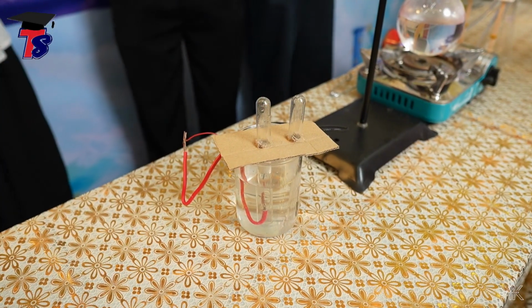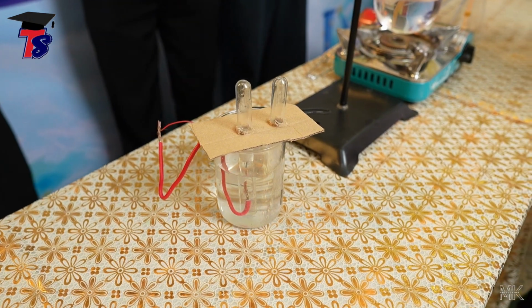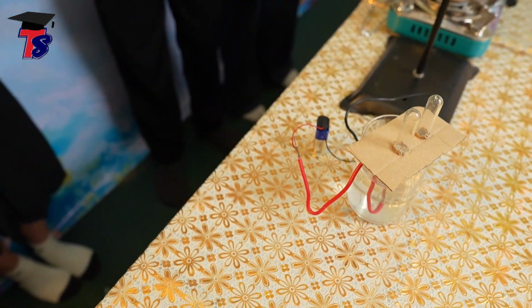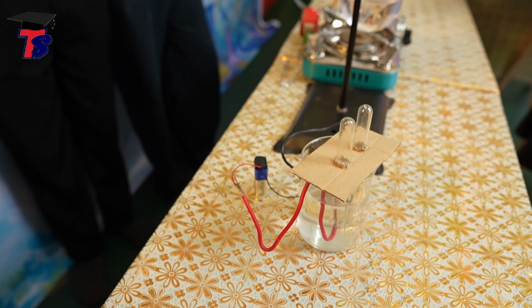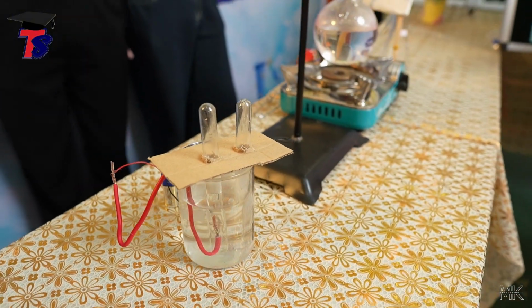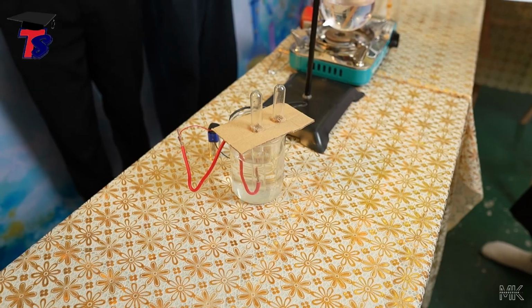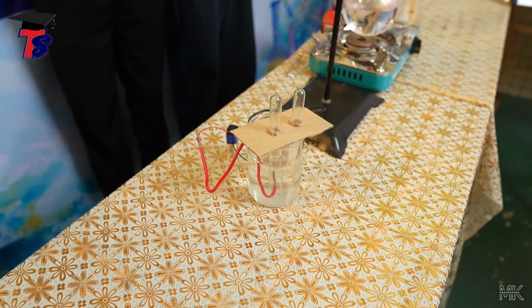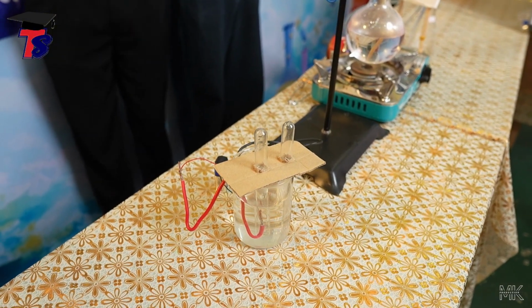As you can see here, this is electrolysis. The wires are connected to a 9-volt battery, and the solution in the beaker is sodium chloride. At the black wire, the cathode, hydrogen gas is produced, and you can see a lot of bubbles there, while the other electrode produces fewer bubbles.